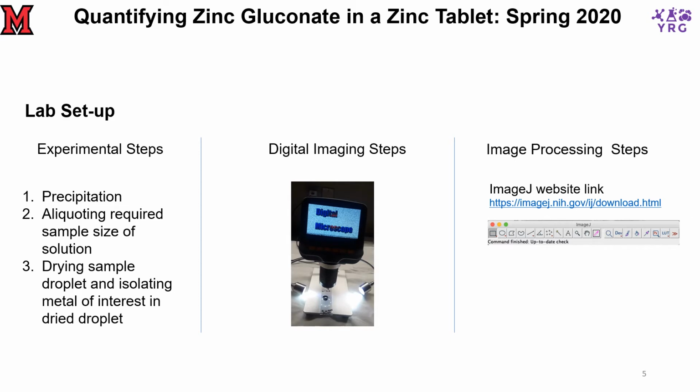The implementation of this design experiment could not be done in spring this year, 2020, due to the coronavirus pandemic. The first 2 columns here could not be done when classes went remote. In its place, ionic zinc images of standard solutions and samples were given to students to process.